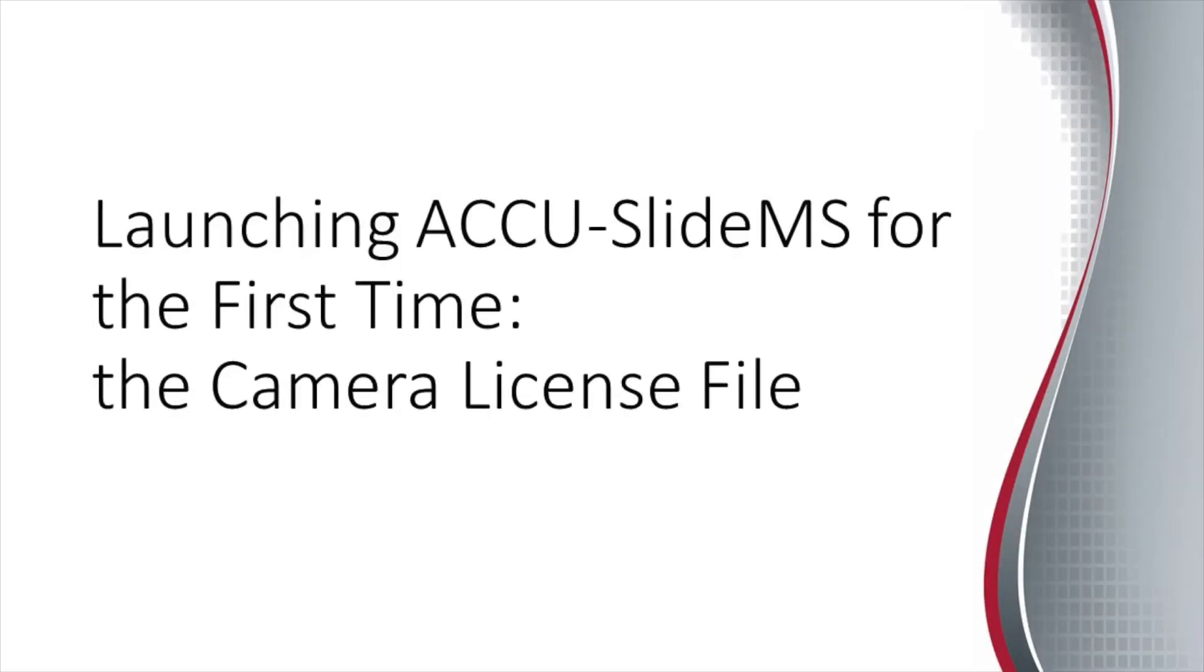Launching AccuSlide MS for the first time, the camera license file. In this step, we will provide AccuSlide MS with the camera license code. This license code is unique to your exact camera and will not work with other cameras.